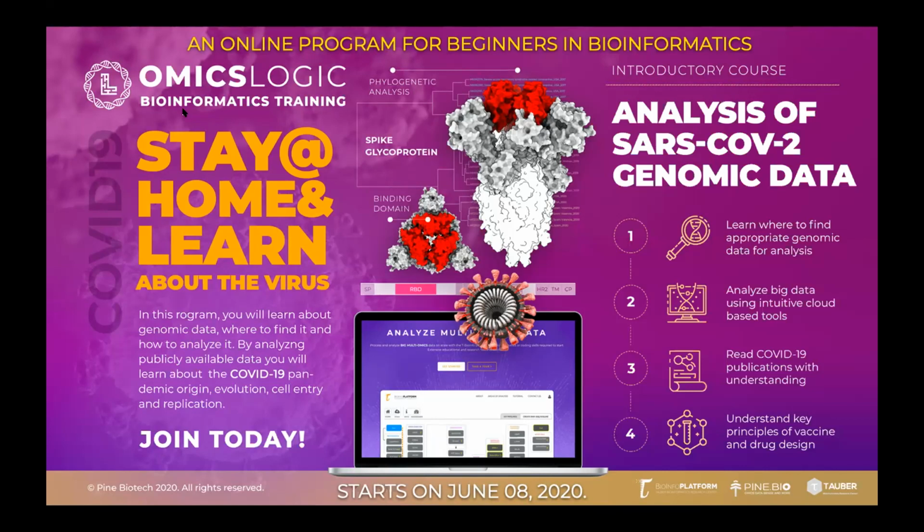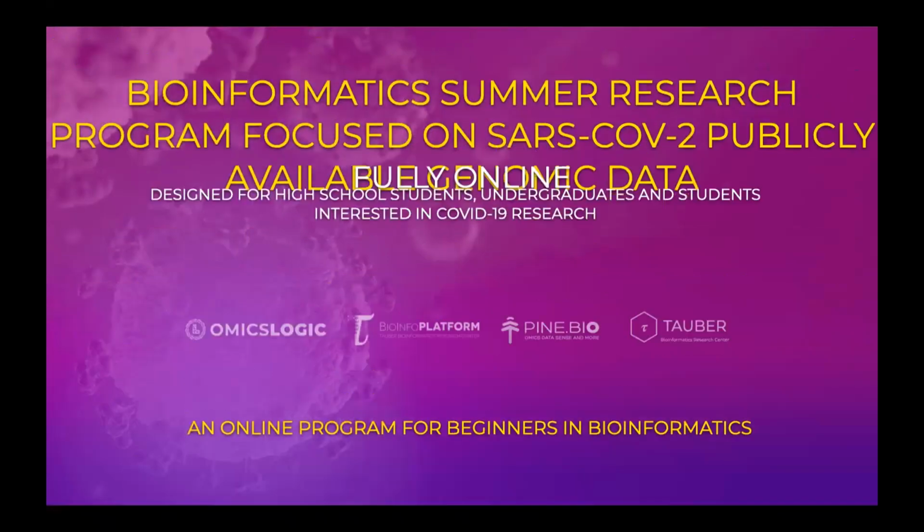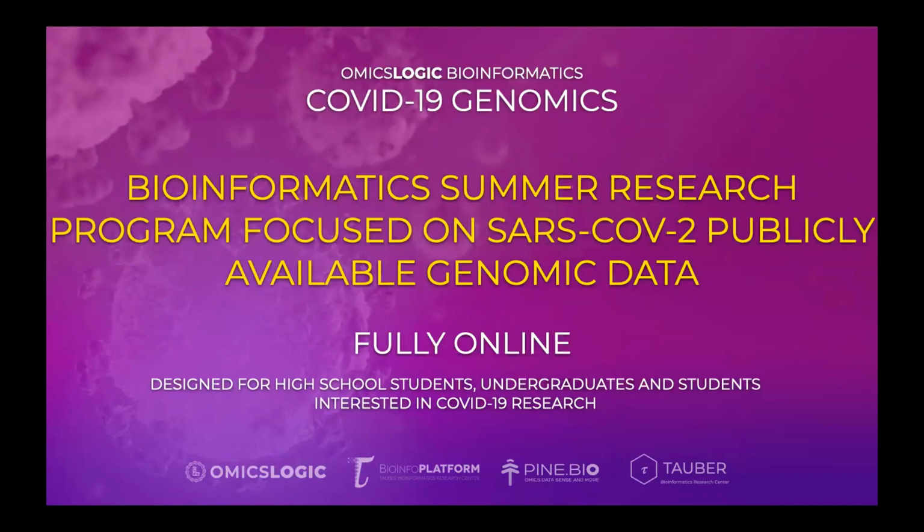So, as I was saying, by analyzing publicly available data, you will be able to see for yourself the clues into the potential origin of this novel coronavirus and understand how the variation between this virus and other similar coronaviruses might affect its biology, cell entry, replication, or maybe transmission. So in this program, we will learn about genomic data, right?